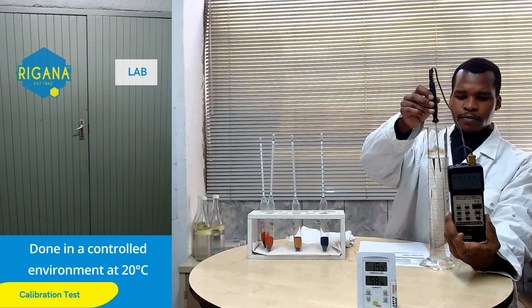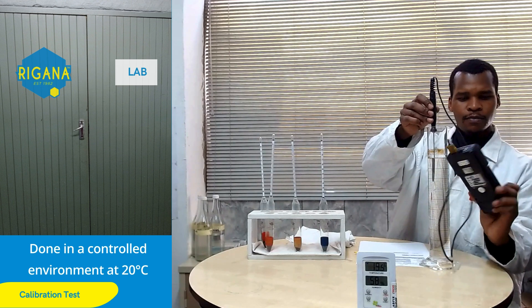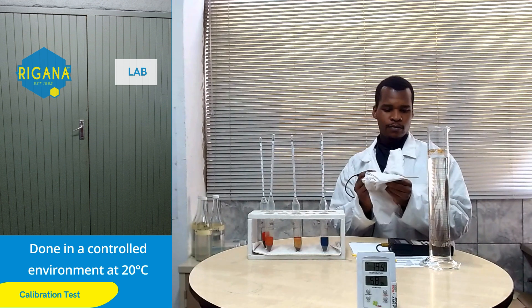Normally calibration is done at three points on the scale, approximately 10, 50 and 90 percent. Check the temperature of the liquid in the measuring cylinder to ensure that it is also at 20 degrees Celsius.